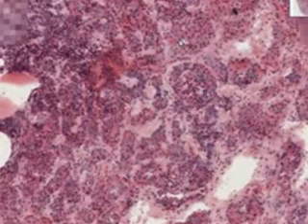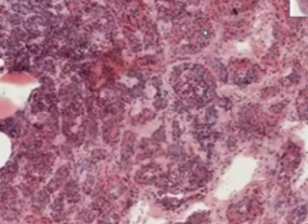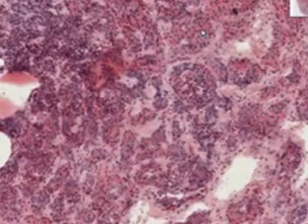Here is a group of acidophils here. The acidophils make all of the hormones of the anterior pituitary, except for the hormones which troph, T-R-O-P-H, or stimulate the thyroid, the adrenal, and the sex glands, the sex tissue.